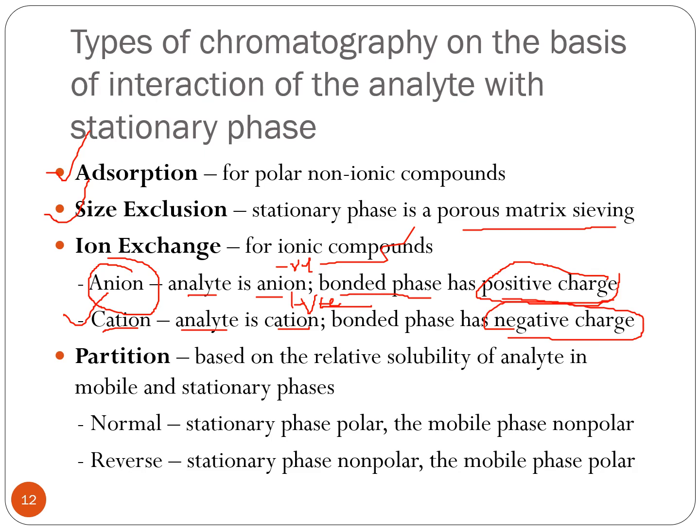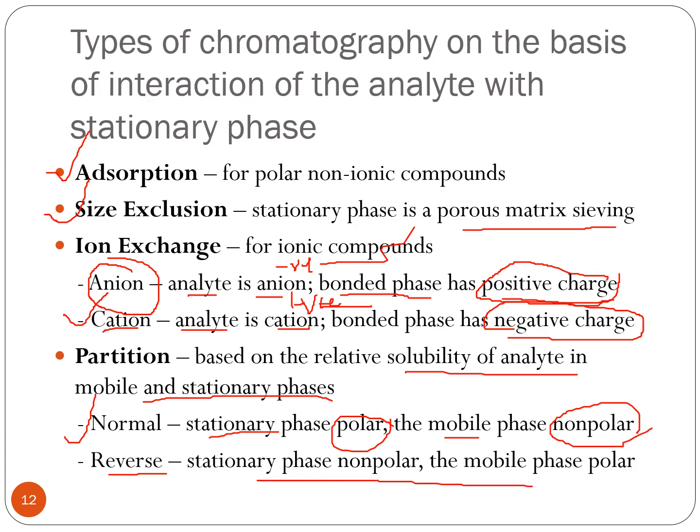Okay, untuk partition pula adalah based on the solubility of the analyte in mobile phase and stationary phase. Okay, untuk normal partition chromatography, the stationary phase adalah polar while the mobile phase adalah non-polar, and it is for reverse partition, dia adalah di sebaliknya lah. Okay, kalau you all ingat untuk adsorption tadi, the stationary phase adalah solid, while for partition, dia punya stationary phase adalah liquid.